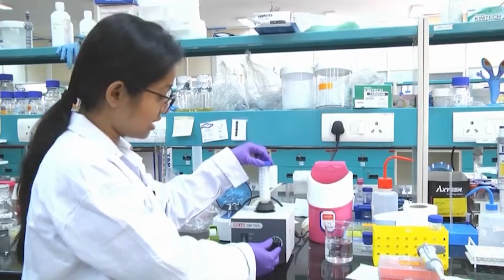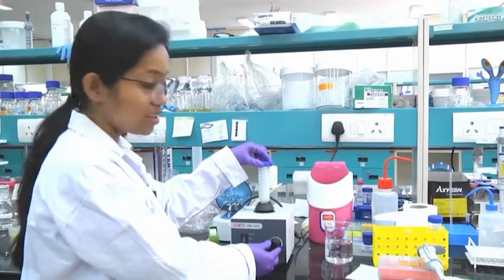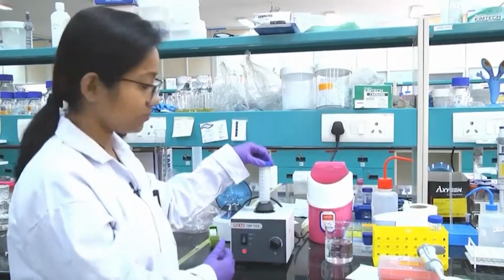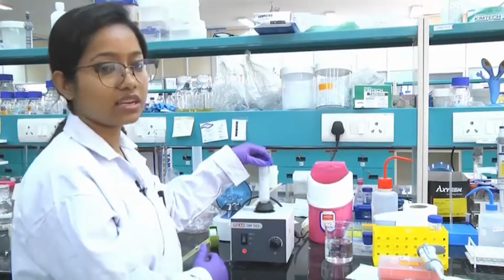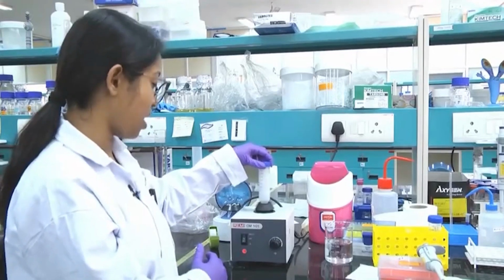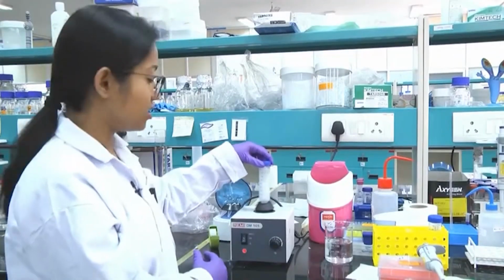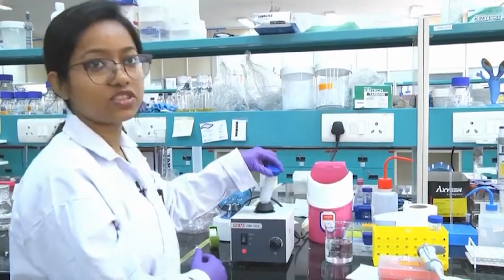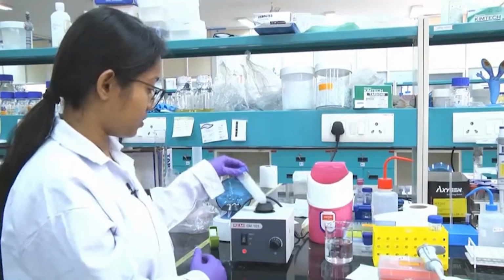Sometimes protein might start to degrade. So, depending on your need and your protein's requirement, you choose the speed. But here, as we are using the crude extract right now, we can be a little bit harsh. So, that is why we are going at a high speed, and this will ensure that my protein is getting mixed up.